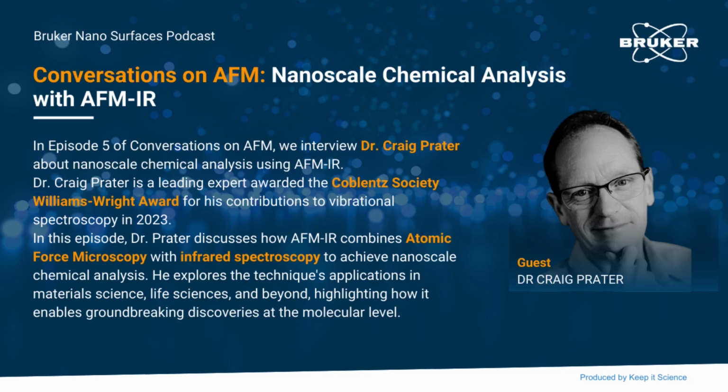So, one could have asked, well, why was conventional infrared spectroscopy not solving the problems of being able to map materials with nanoscale spatial resolution? And the reason is that conventional infrared spectroscopy is an optical technique, and the best spatial resolution that can be achieved by that technique is limited by optical diffraction and dependent on the wavelength of the light that's being used.